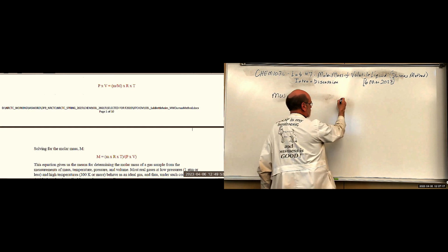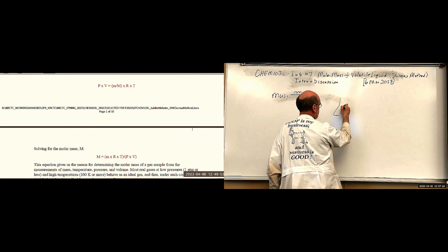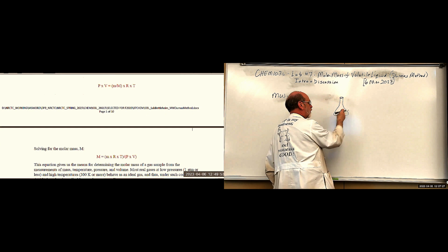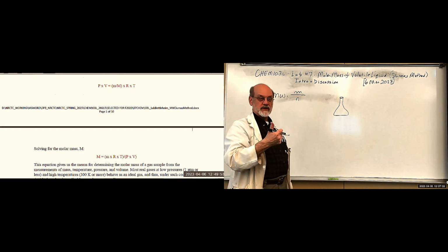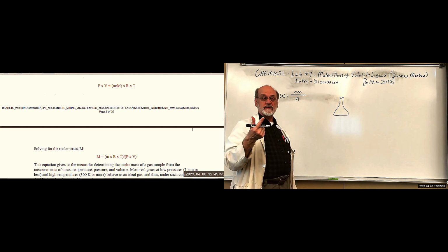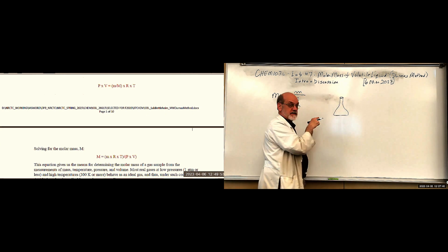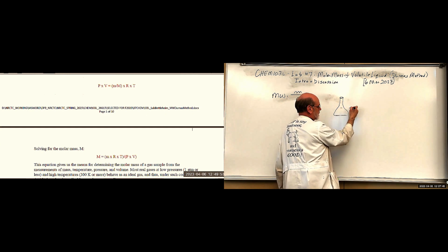We're going to have a 125 milliliter Erlenmeyer flask, and this whole volume is going to be filled with the gas at a known temperature, a known barometric pressure. We're going to determine the exact volume in this flask, because 125 is up here somewhere. You need the entire volume, right? And it's in the neighborhood of 145 milliliters.